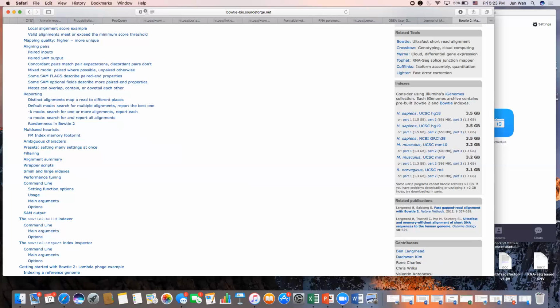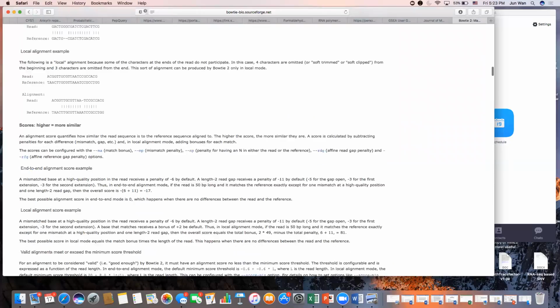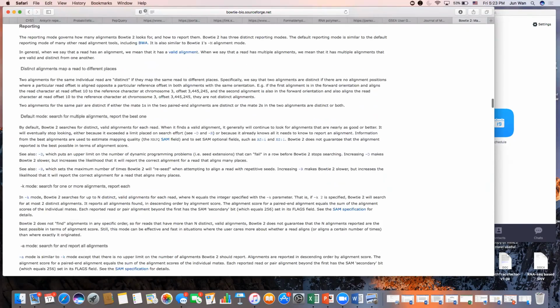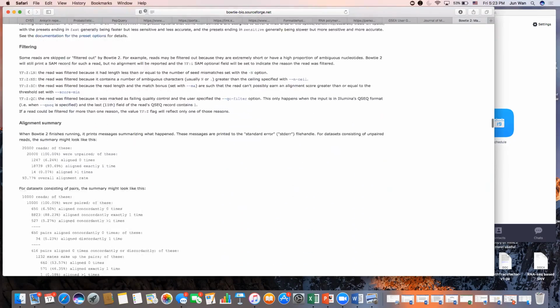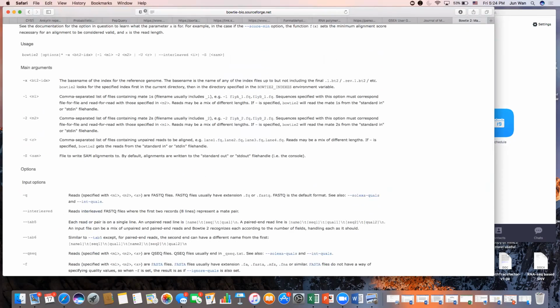Any more questions on Bowtie 2? Yes, ma'am. MM10 is, when you unzip it, it's going to have 6 files. Correct. So in the code, are you giving the path to the MM10? Yes. So what you're going to do is let me slide right back down, and it'll make this part of the conversation much more sensible. So it's the path to that index, because the index itself is really considered all 6 files. Okay. So you don't have to list all of them.